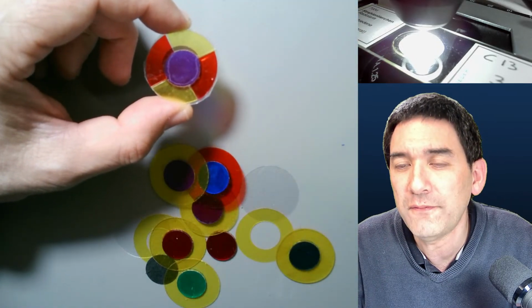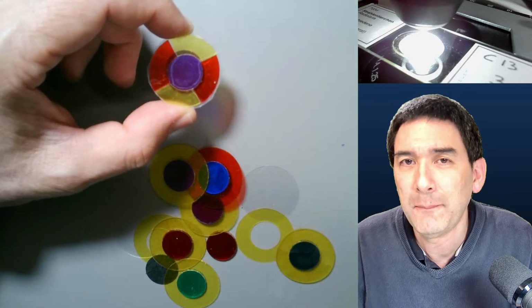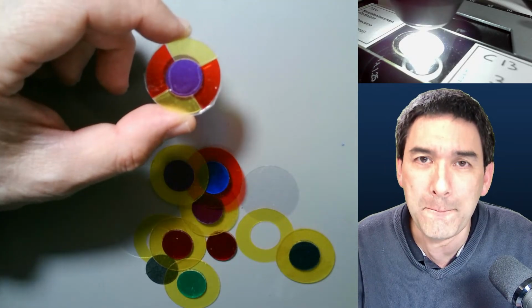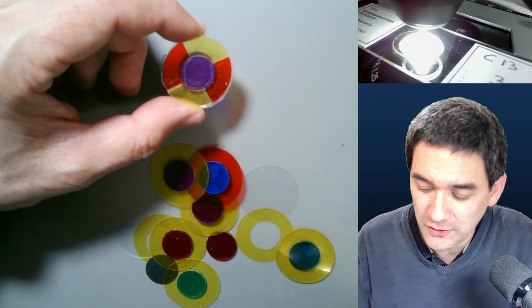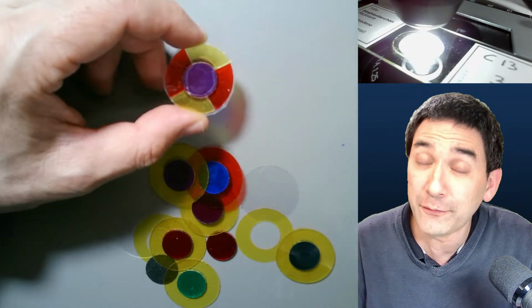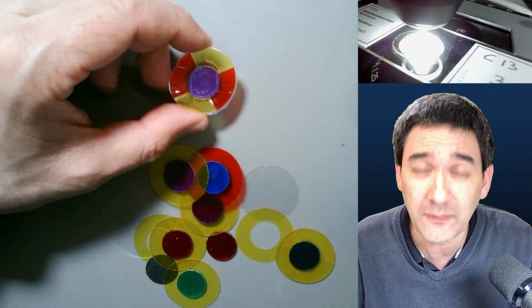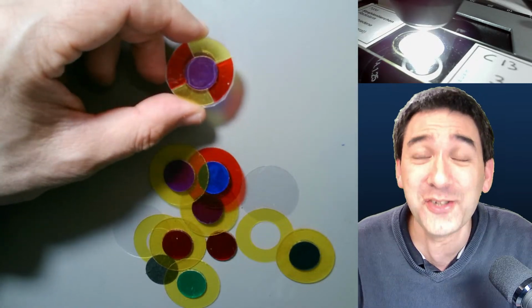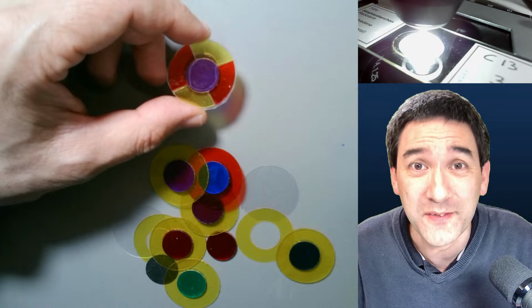Is there a way to make a phase contrast filter? That's the following. You can make, of course, phase contrast filters. You have to really measure this out. However, this will not give you phase contrast unless you also have phase contrast objectives.